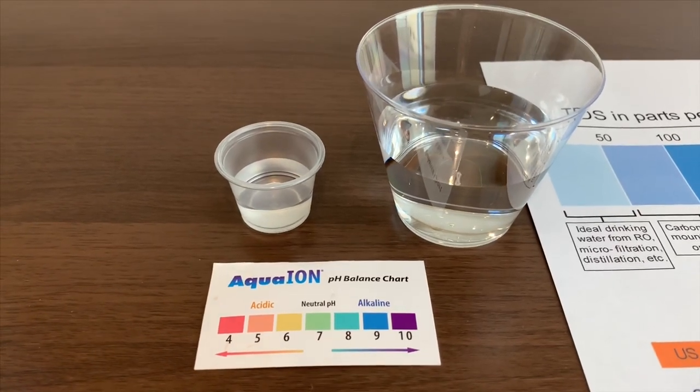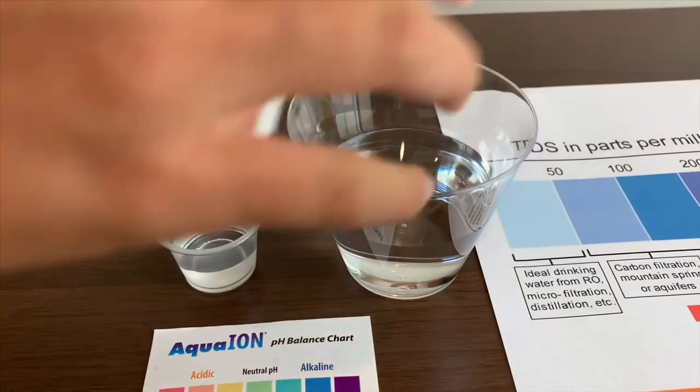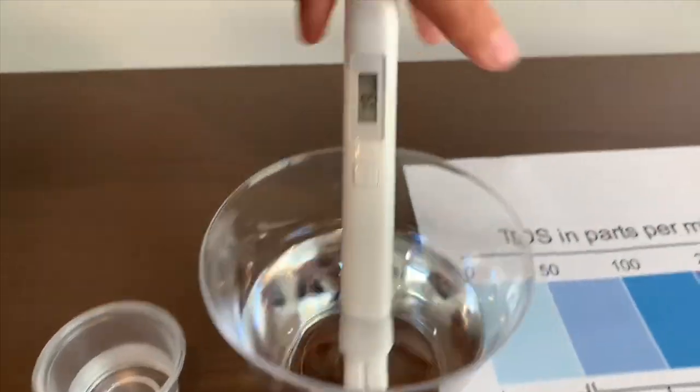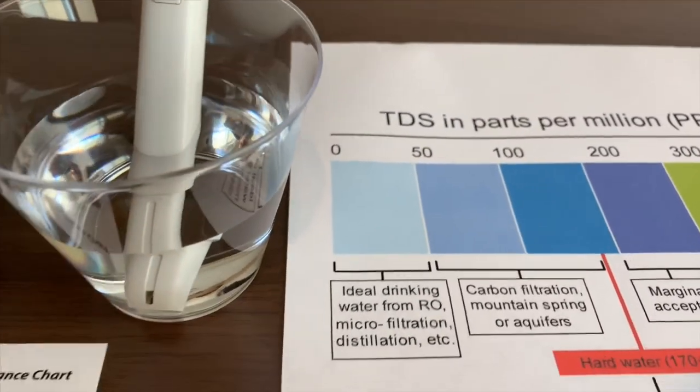Let's test the TDS level first. Turn on the TDS tester and make sure it says 0. Put it in and let's wait. 22. That is ideal drinking water.